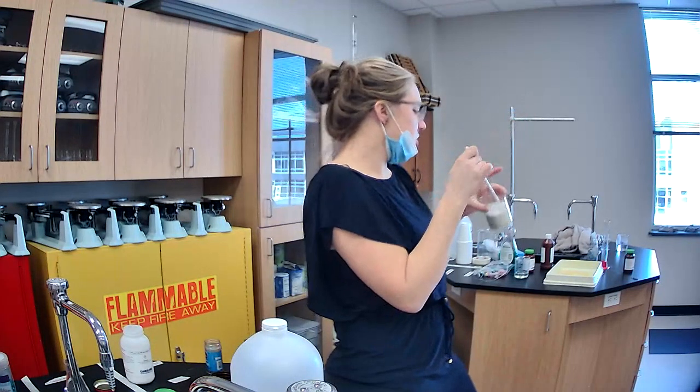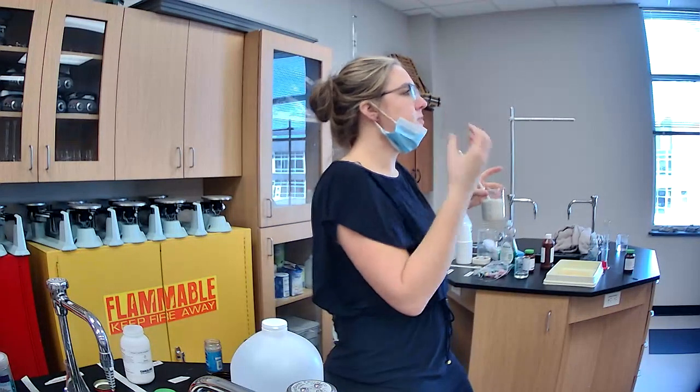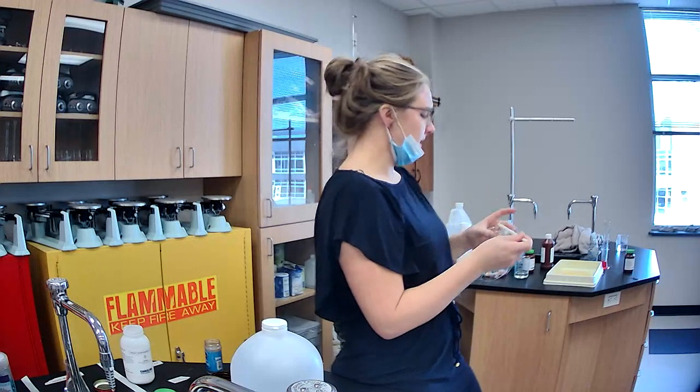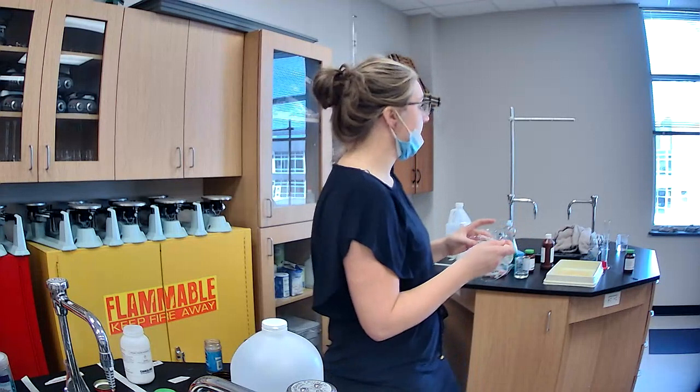We're not going to use a thermometer because it's not really changing. We would use one to measure the change in temperature, but it's not changing enough to make a huge difference. So is that what happens to salt water? I don't know, that's a good question. I don't know if it's yeast or something else. Great question.